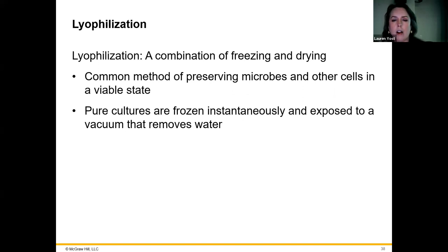Okay. Lyophilization is a combination of freezing and drying. A lot of times what we'll do is put something in some little tubes, spin them in a centrifuge, suck all of the air out of the centrifuge and get it super, super cold and freeze that while we're sucking all of the moisture out and the air. Okay. So that dries it out at the same time.